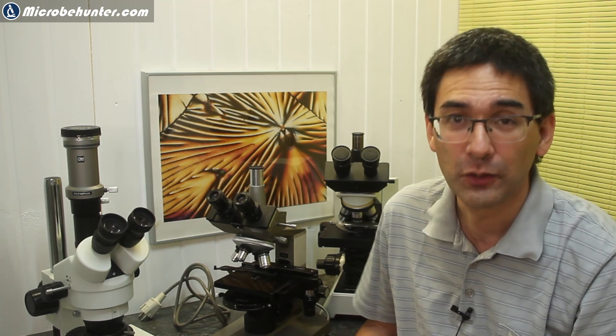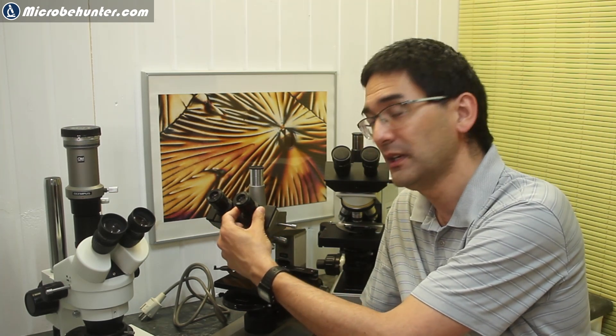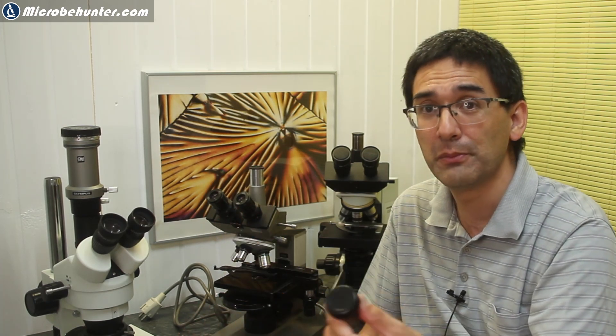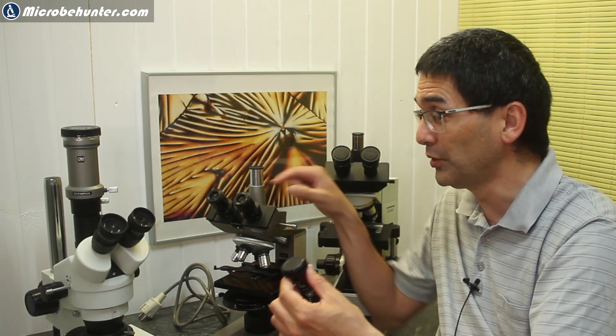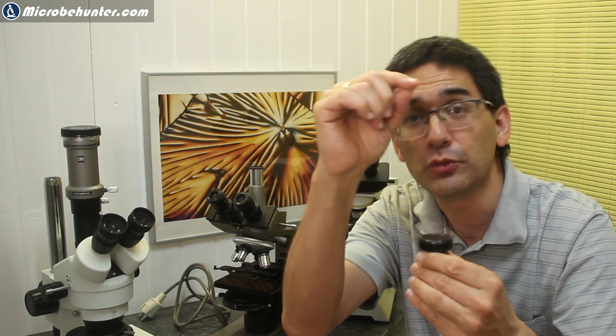There is another thing that you have to take into consideration. The Japanese standard also has a different tube length of 170 mm. I know all of those numbers are getting a little confusing. So it is possible to adjust this by sometimes rotating the eyepiece out so that you're able to mount the more common standard. And then you have to also make adjustment to the distance. The reason being that those two are not only different in length, but also at the place where they create the image.